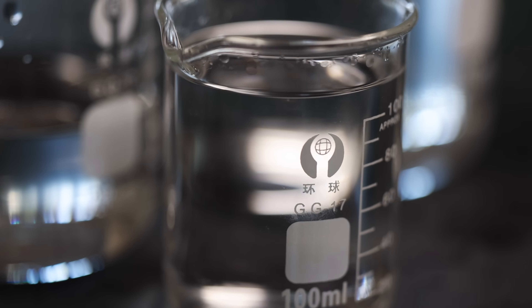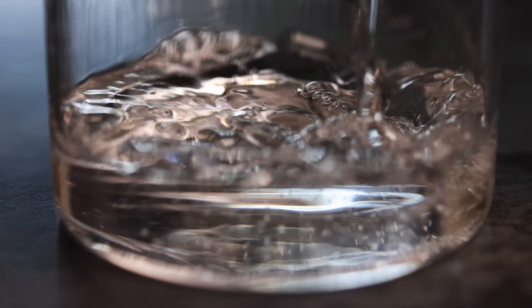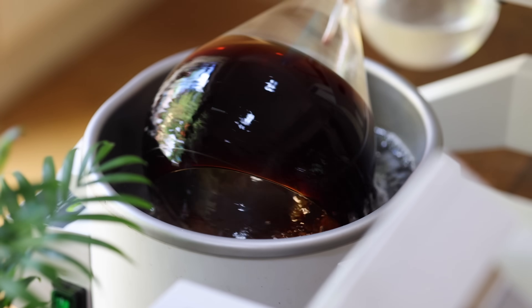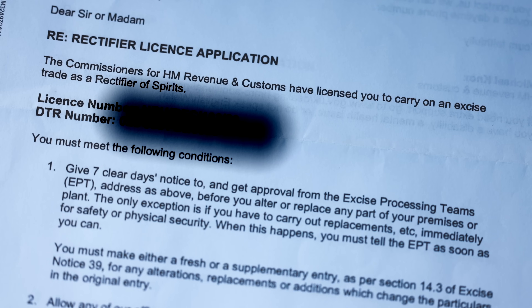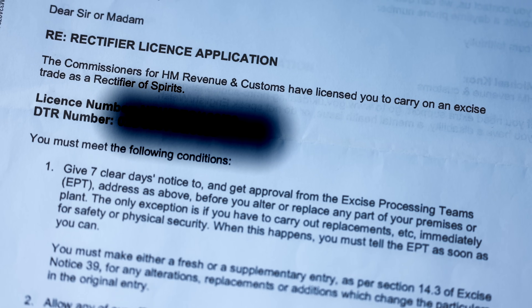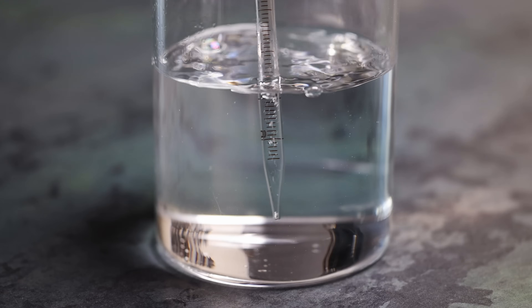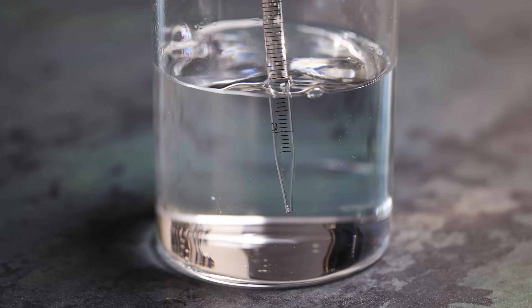Those two categories are: low temperature distillation and isolating flavors, and concentrating and intensifying flavors at low temperature. Starting with alcohol distillation as the most conventional food and drink application — I'll quickly note that technically you need a rectifier's license to do the sort of distillation I'm going to talk about here. I got mine a few years ago, but you should check what the rules are in your local area. I use the Rotavap to distill various alcoholic and non-alcoholic mixtures for culinary use, and to make my own gin.